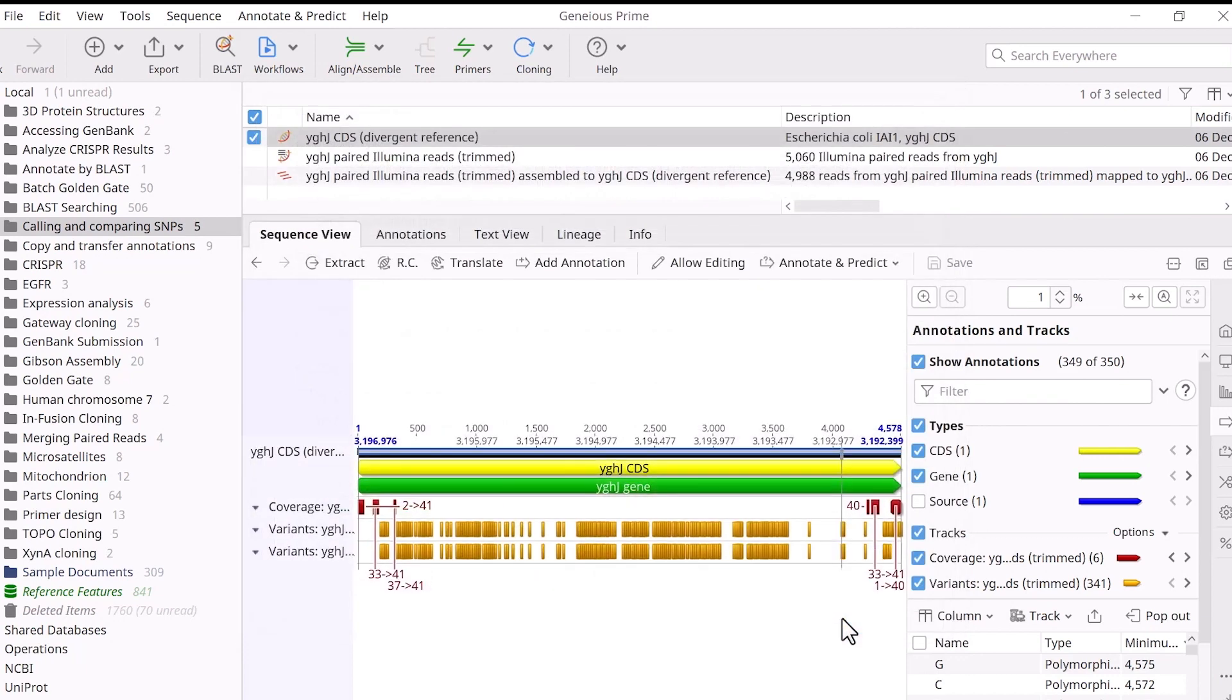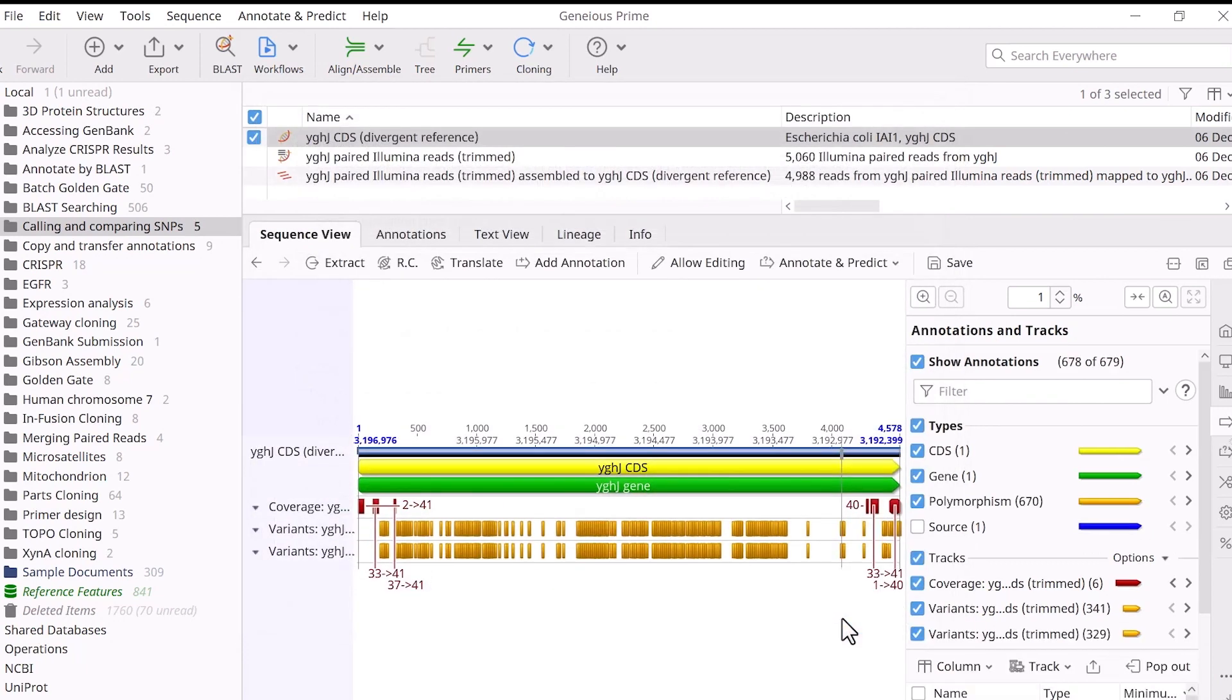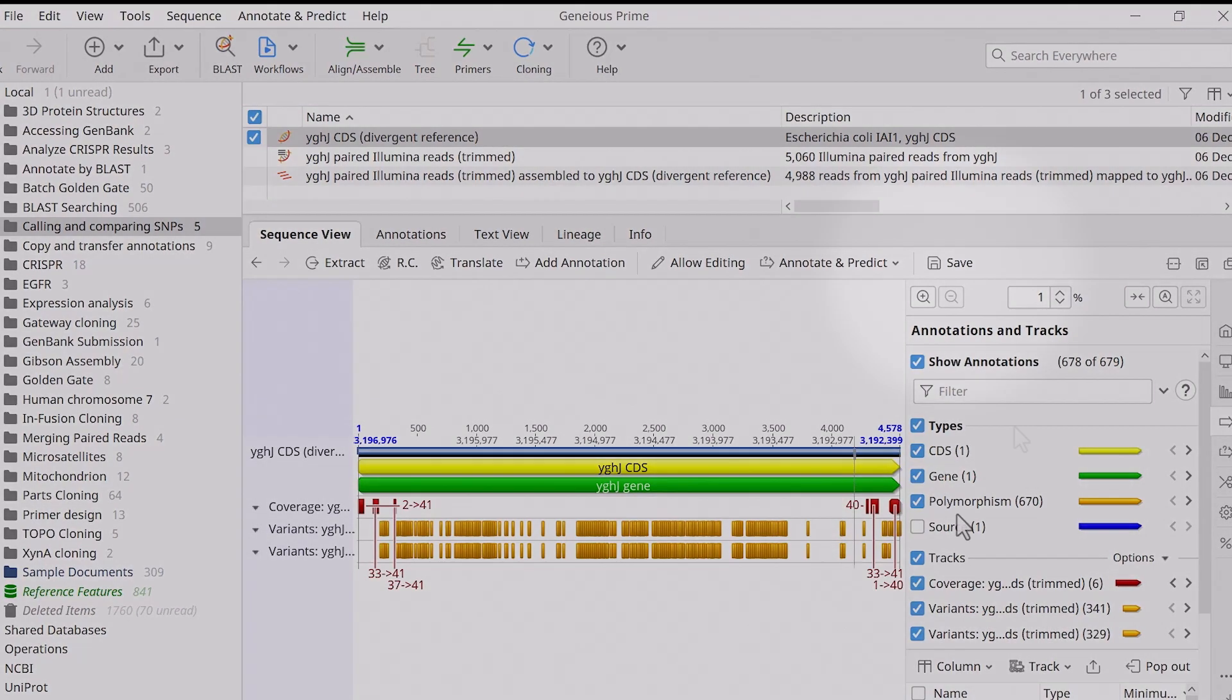Finally, click OK to run the analysis. The result is a new track. This track has fewer polymorphism annotations than the original variance track since it no longer includes the annotations in the low coverage regions.